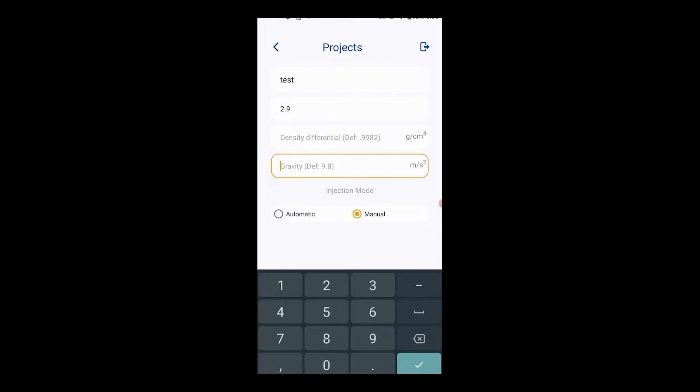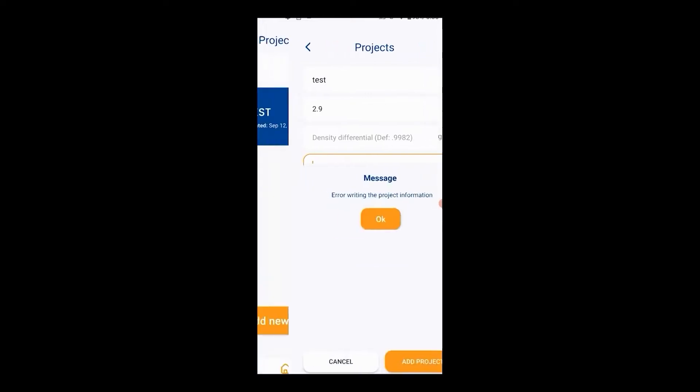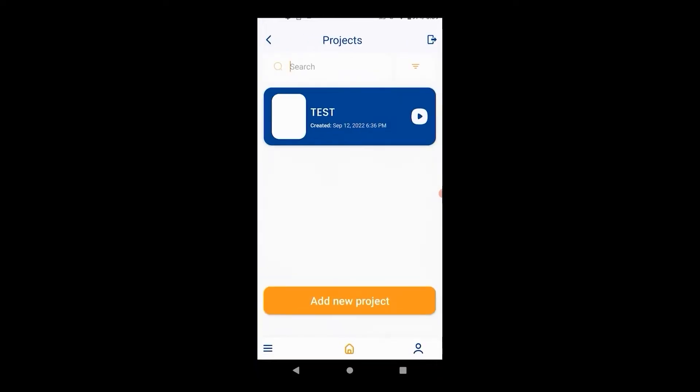The default value is 9.8. If you wish to provide a more precise value you can. Select the injection mode depending on if you ordered the automatic dispenser hardware add-on. Click on the newly created project and enter image capture screen.